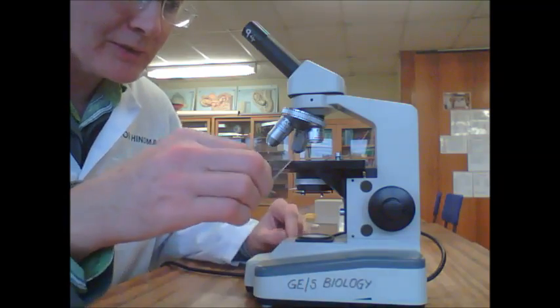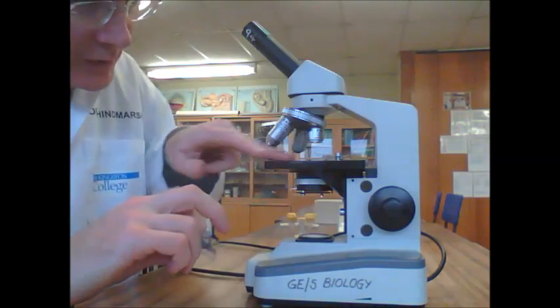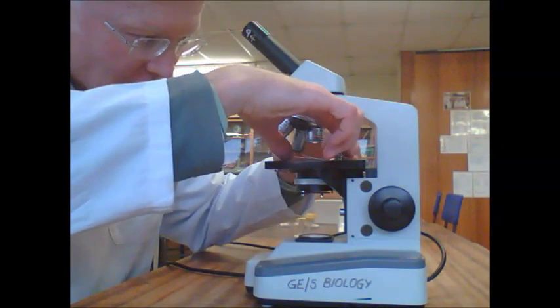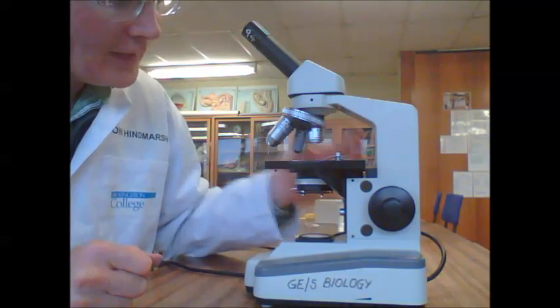What you can do is take the slide and place it onto the stage — this is the stage. There are clips on the stage which you can lift up by pressing on the back of them. In goes the slide.